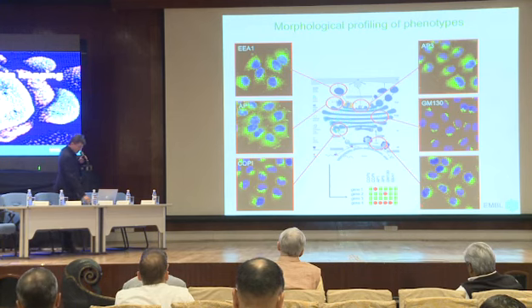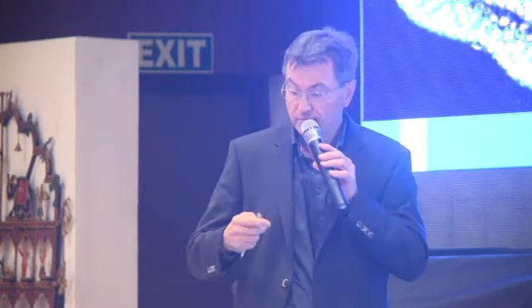Now, in order to be able to do this not only for 4 or 5, but for a whole battery of markers, and eventually not only restricted to antibodies, but also in situ hybridizations, we have been developing and automating a method with feedback microscopy that we call on-stage multi-labeling fluorescent microscopy. We take a directly labeled antibody and stain the cells, like for example here the nucleus.